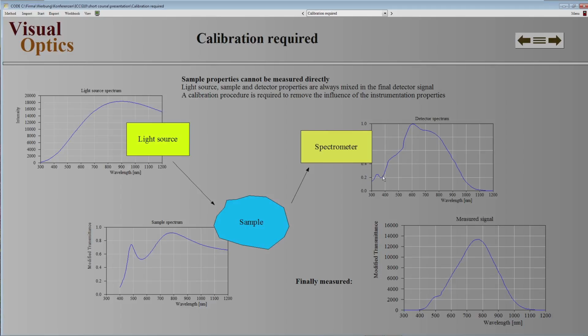Each one is responsible for a single wavelength, so you have a few hundred detectors here, and each detector has its own sensitivity. Usually in the near infrared it's 0 if you use silicon detectors. There's the band gap of silicon, and there's no absorption above 1100 nanometers. There's a maximum usually in the visible, and depending on some details, a certain substructure, and less sensitivity for ultraviolet radiation.